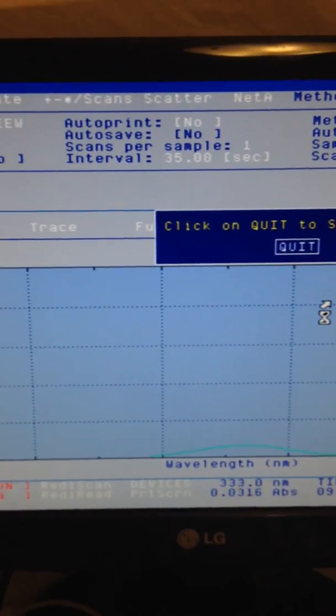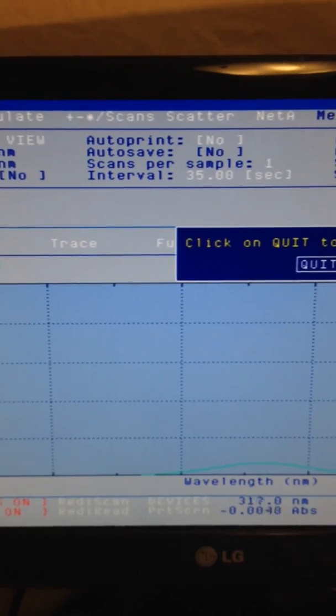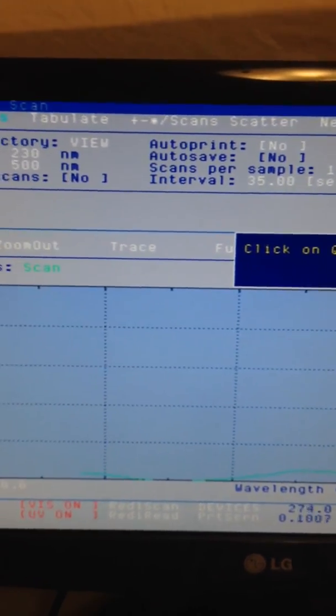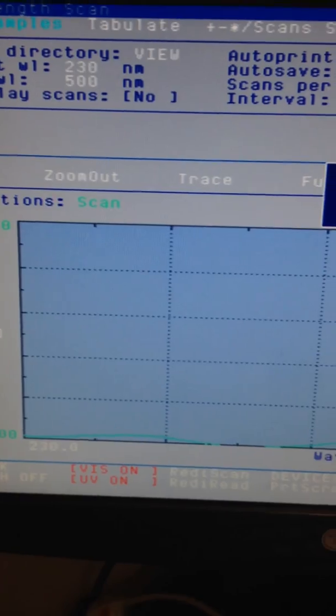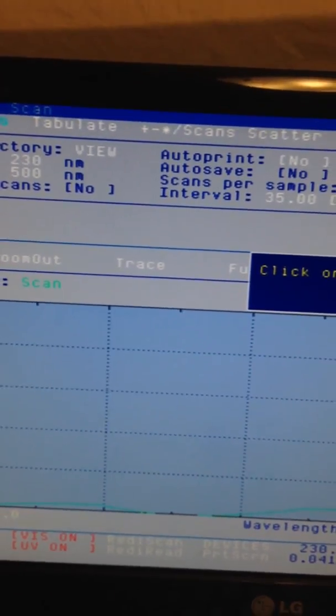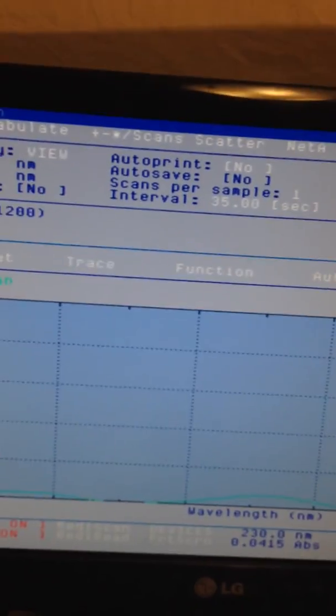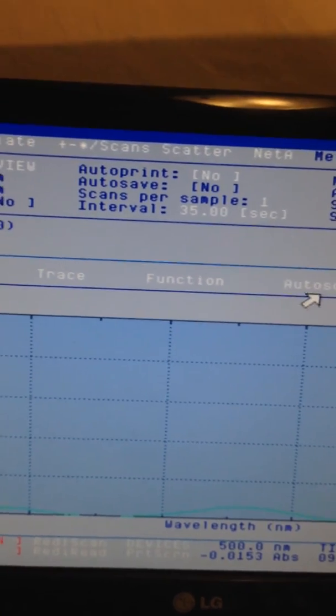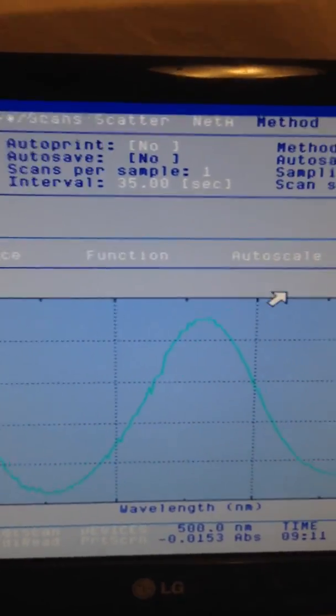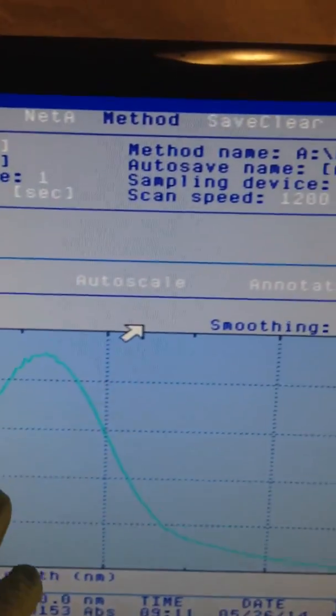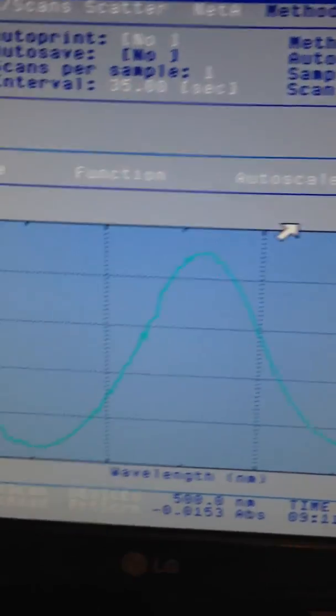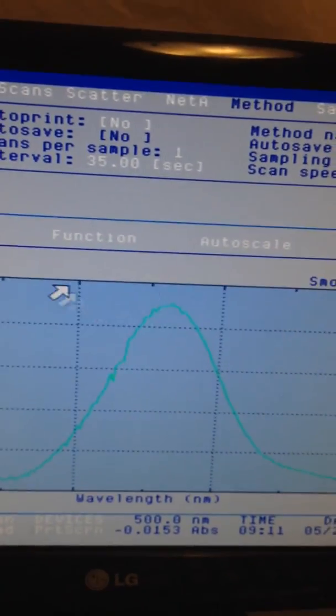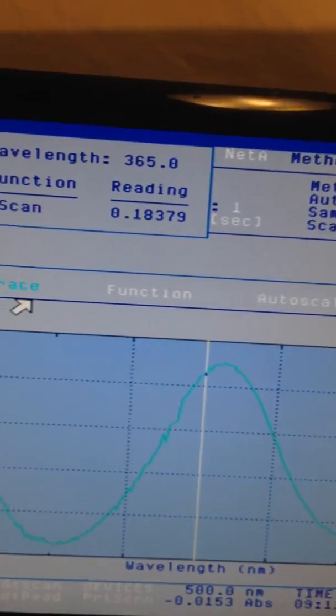You can auto scale to see the spectrum, which does have absorption. If you click on trace, it shows absorption close to 371 nanometers, though it depends on the solvent.